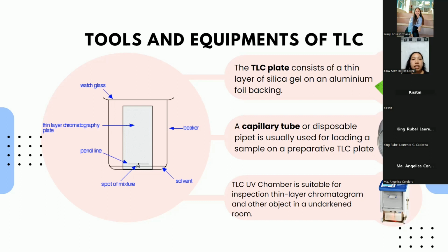Next po is the TLC sprayers, used for uniform spraying of reagents onto TLC plates, can be used with most TLC reagents and corrosive liquids. Typically po siya na ginagamit sa glass.